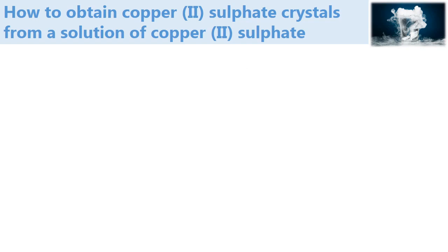Because copper 2 sulfate crystals have what we call the water of crystallization.